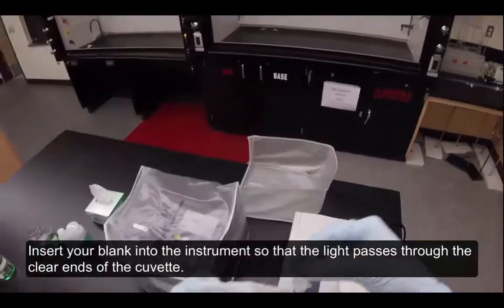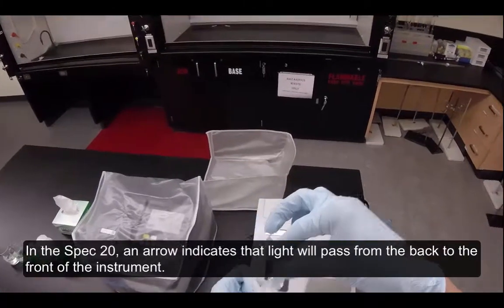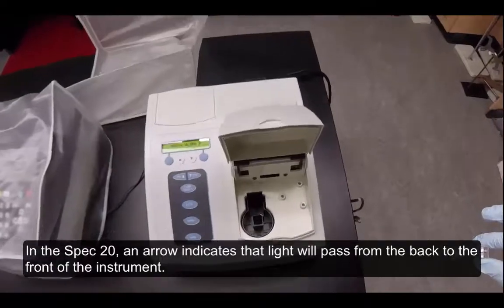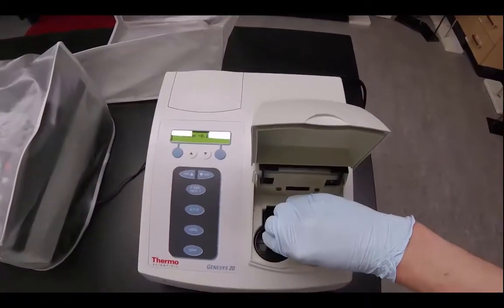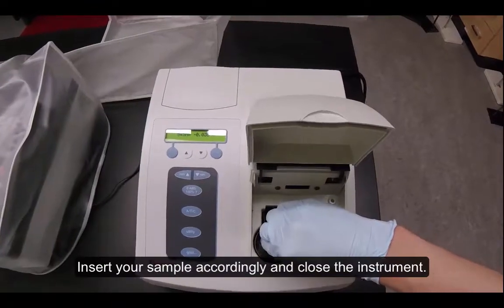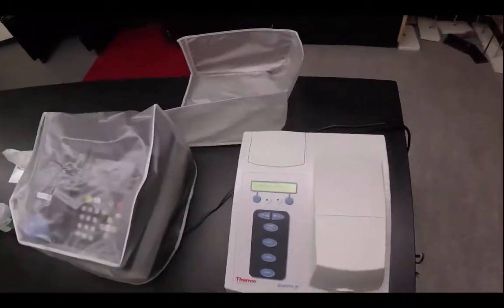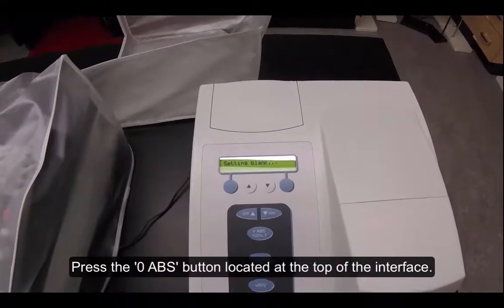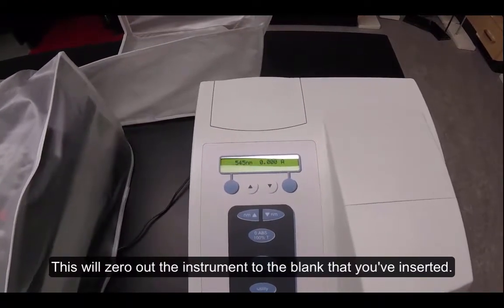Insert your blank into the instrument so that light passes through the clear ends of the cuvette. In the SPEC20, an arrow indicates that light will pass from the back to the front of the instrument. Insert your sample accordingly and close the instrument. Press the 0 ABS button located at the top of the interface. This will zero out the instrument to the blank that you've inserted.